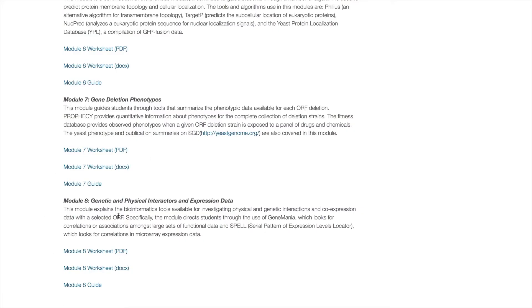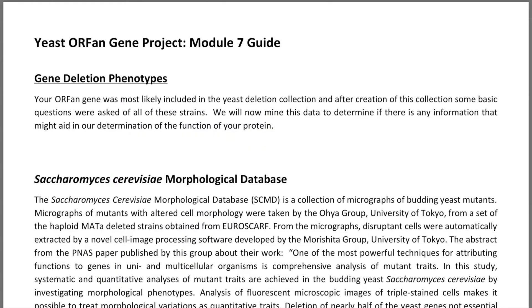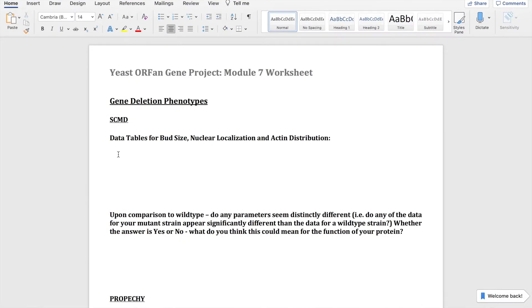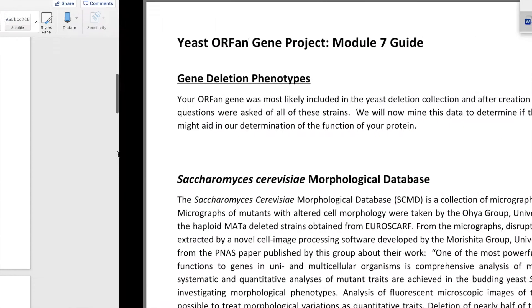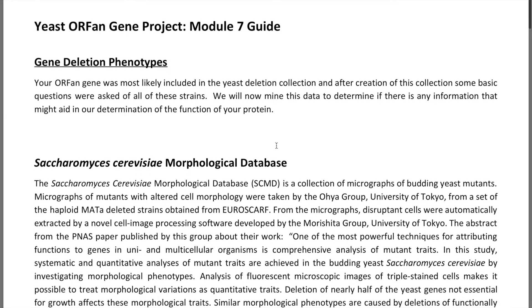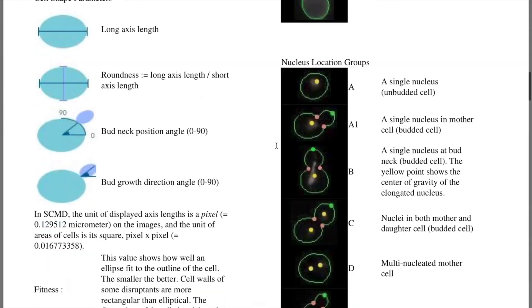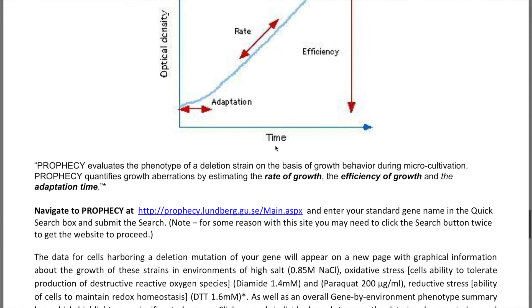We're going to get started by opening the module 7 guide and the module 7 worksheet. This module starts with working with the Saccharomyces cerevisiae morphological database, but unfortunately that program has been discontinued so we're not going to start there. I am going to scroll all the way down and start with PROPHECY by opening that up.